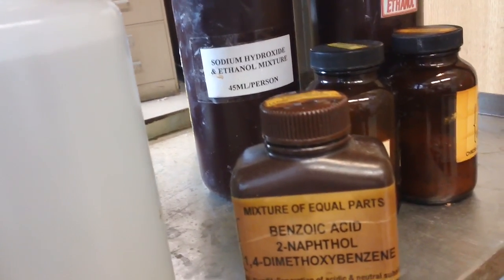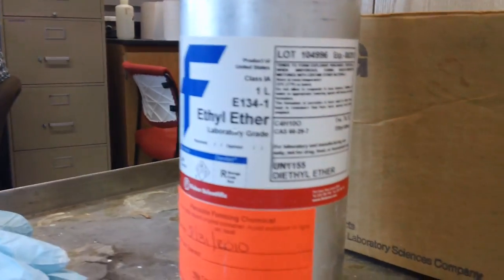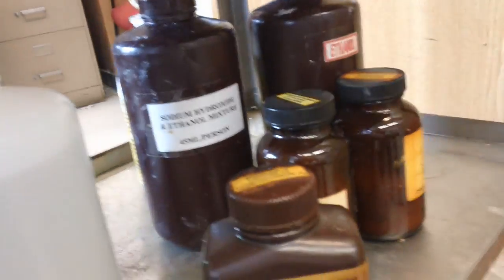Okay, so benzoic acid, 2-naphthol, and 1,4-dimethoxybenzene dissolved inside of ether, then placed inside of three beakers.